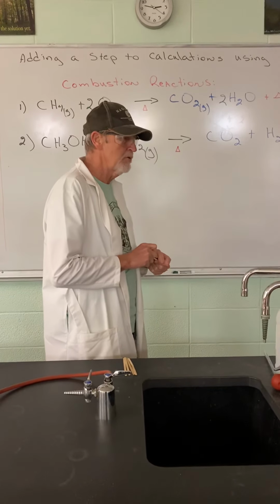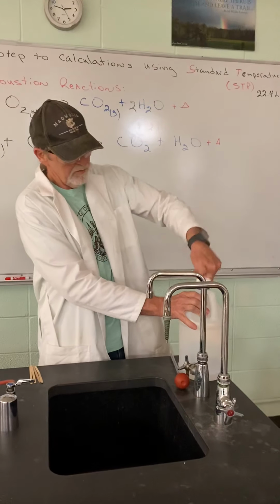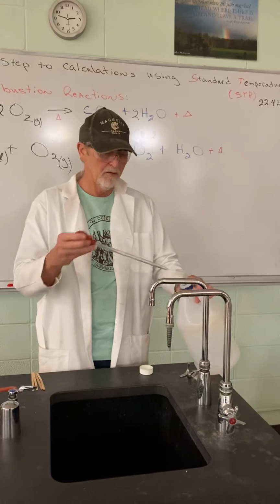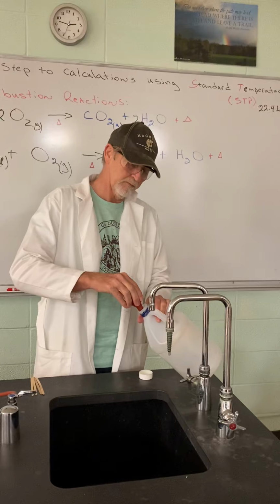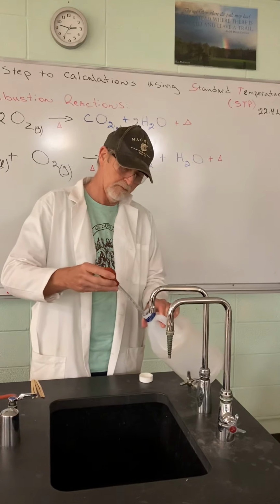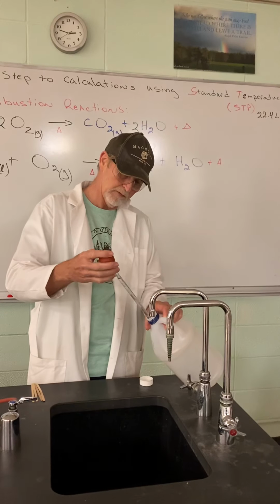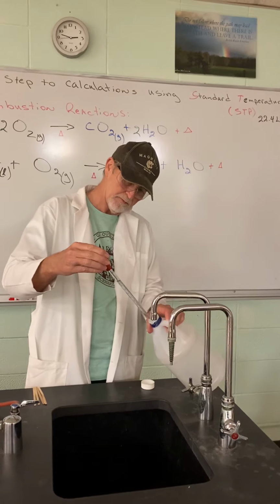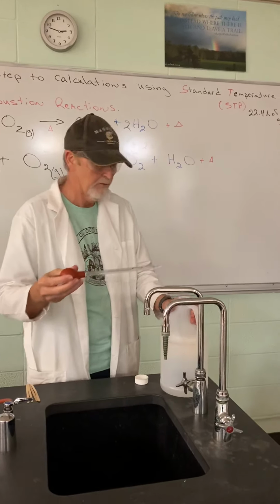So what I'm going to do is take the methanol, about 10 milliliters. I'll put about 5 in each.